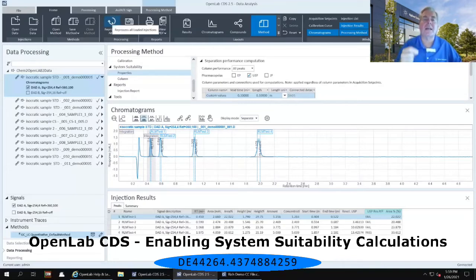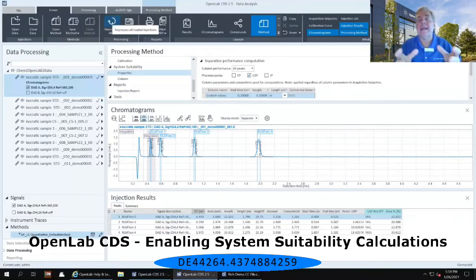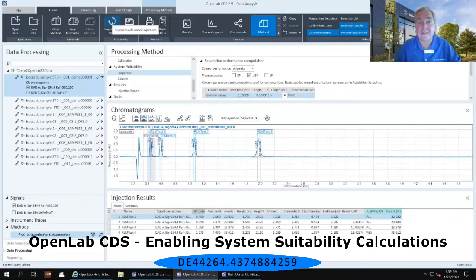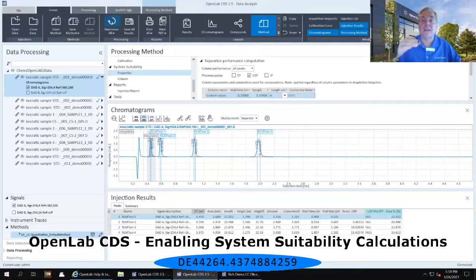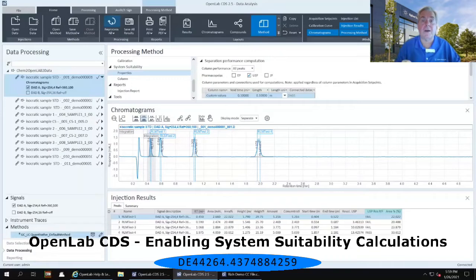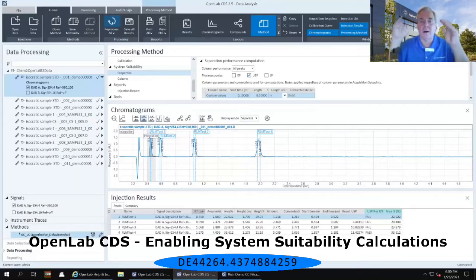That is because Reprocess All is required — the custom calculator is a program that is never engaged until all analyses are completed. If you tried to do a partial processing, or right-clicked on the first injection and went to process only selected injections, the custom calculator would never engage because it hasn't finished all of those injections. So if you're using a custom calculation file, you must reprocess all in order to engage the custom calculator at the end of that final injection.